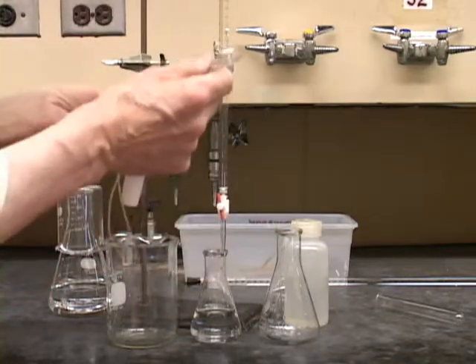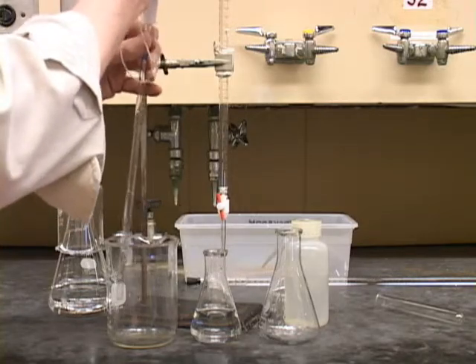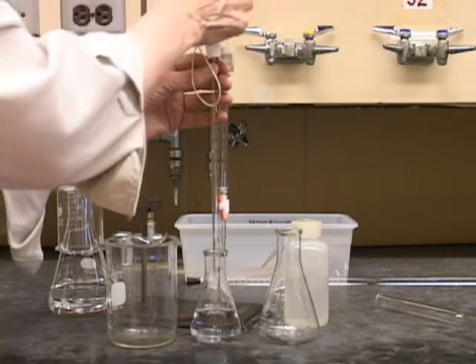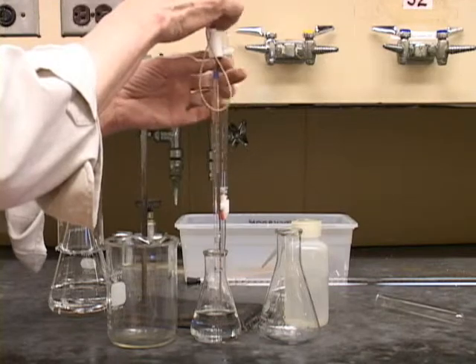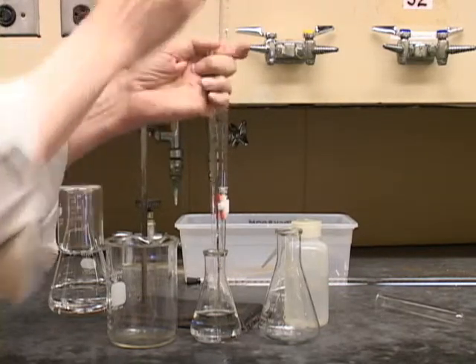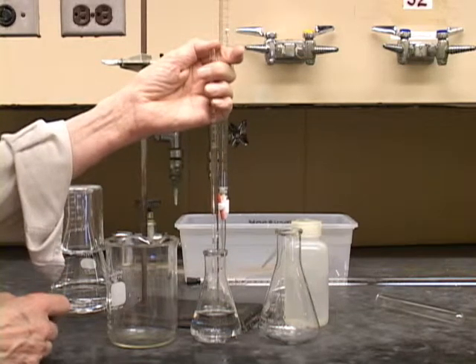Get this rinsed out and put it in a waste bottle here, the slop bucket. Now for keeps, we will draw this up. Here's the 0 mark up here. And we're drawing it past the 0 mark. We'll bring it right down to the 0 mark.